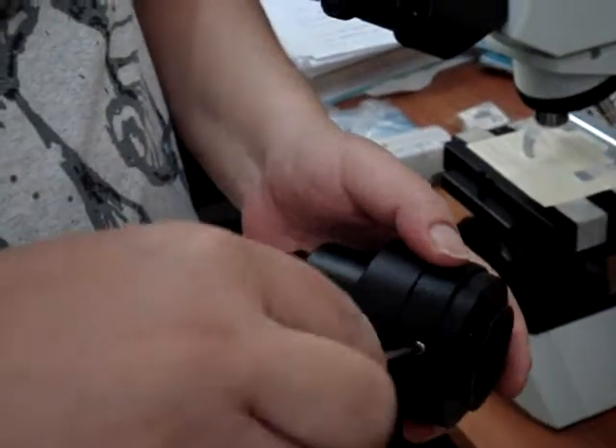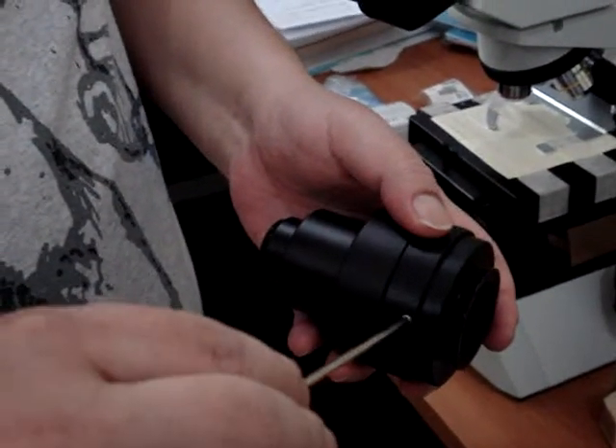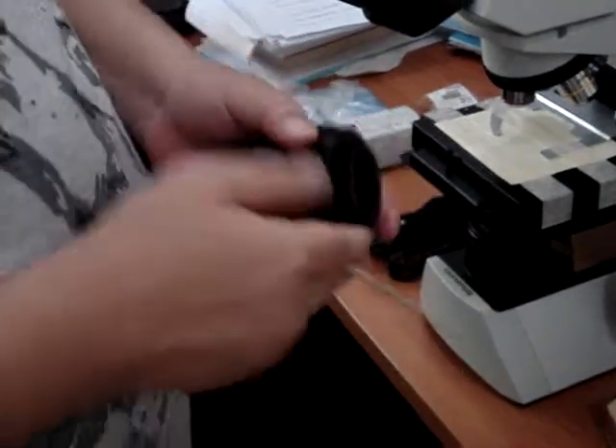Lock it. Lock it. And release the cover from the trinocular.